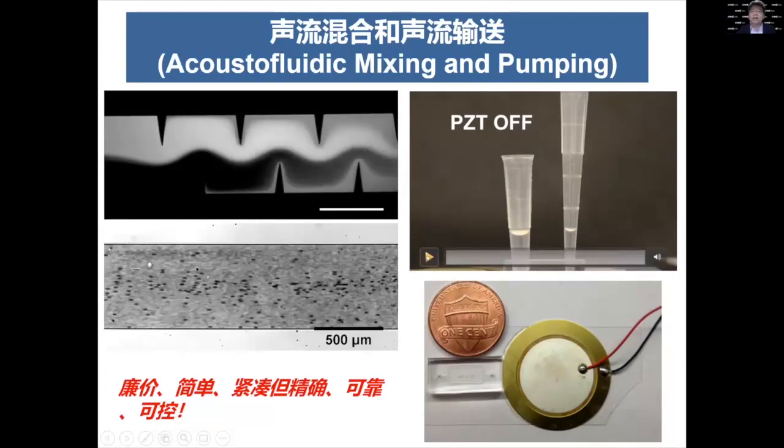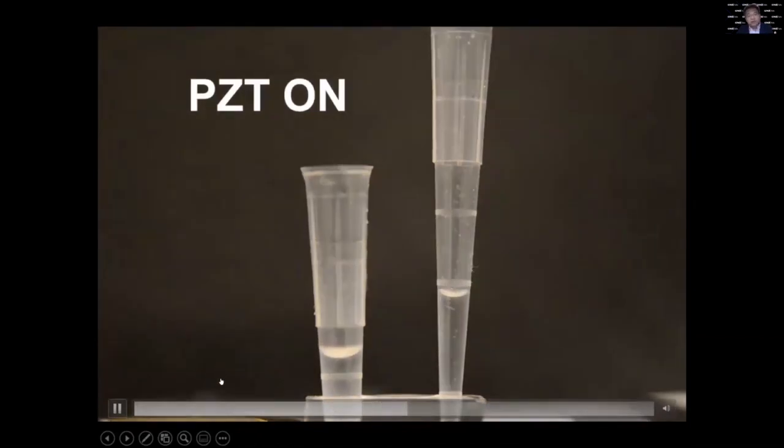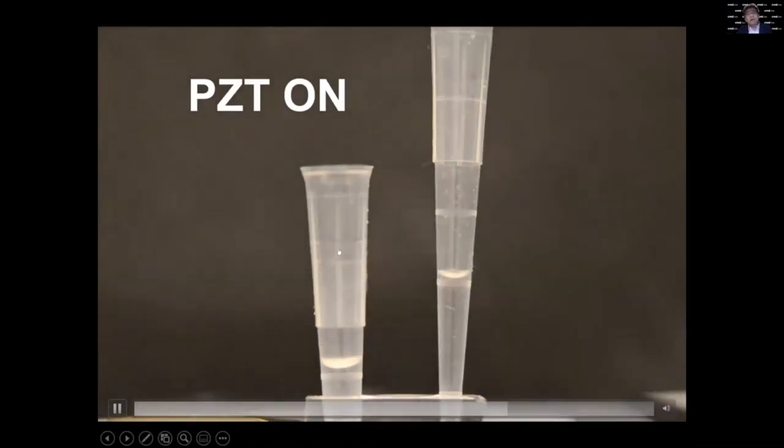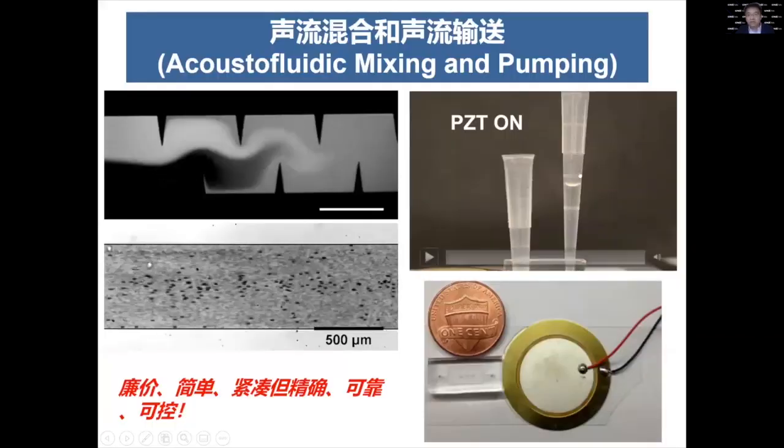So this one shows that when we use two pipette tips, one as inlet and the other as outlet, and we turn on the acoustics, you can see our device has enough horsepower to push fluids from one reservoir to the next reservoir.